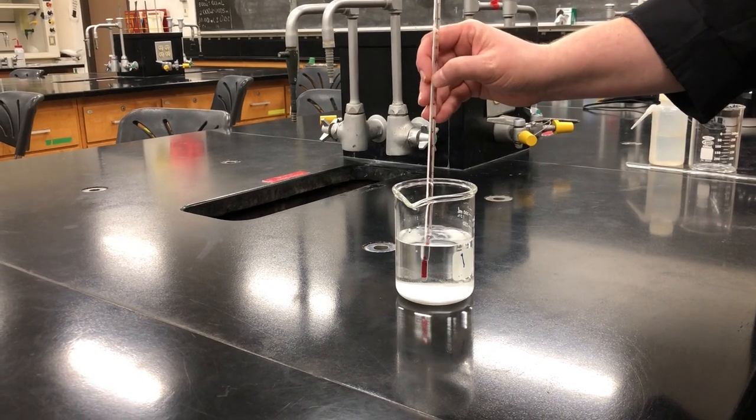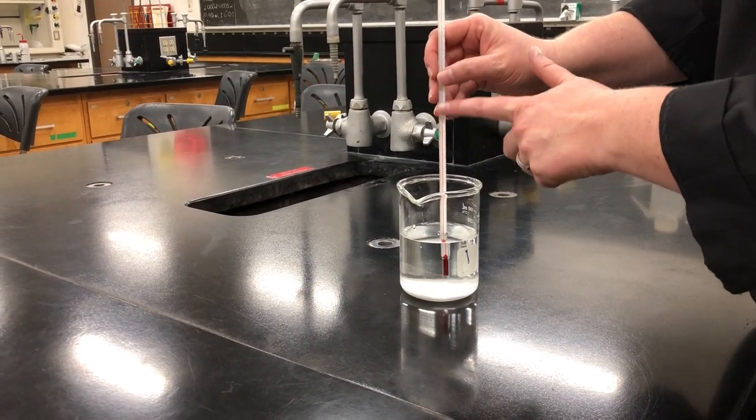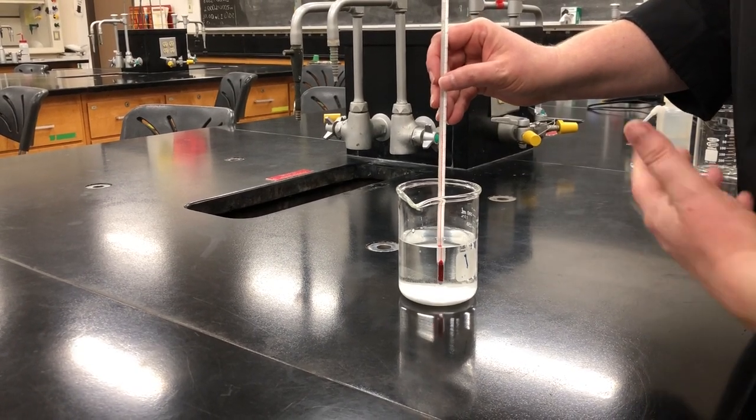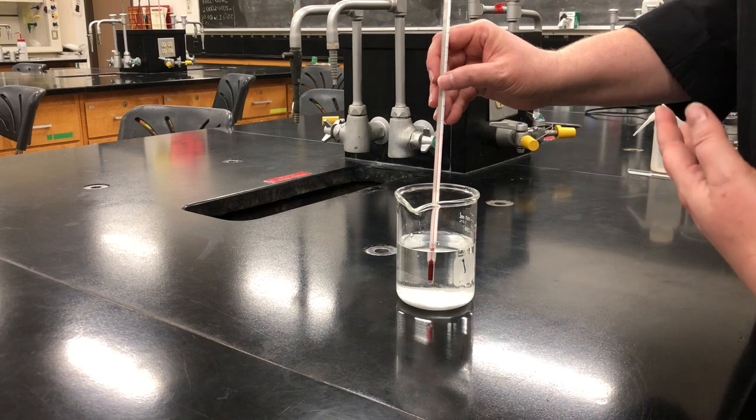We're just going to give it a little swirl, and then when you see the temperature, the red alcohol inside of the glass there, you want to read the temperature once it has stopped moving.